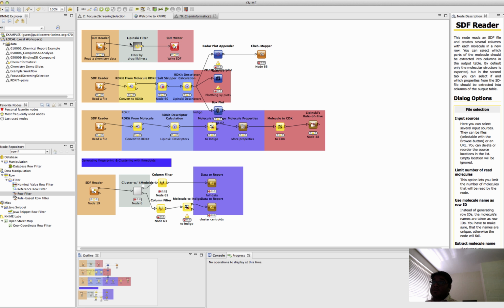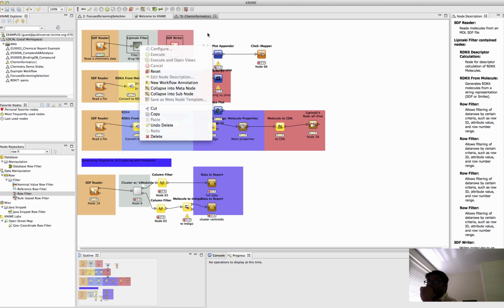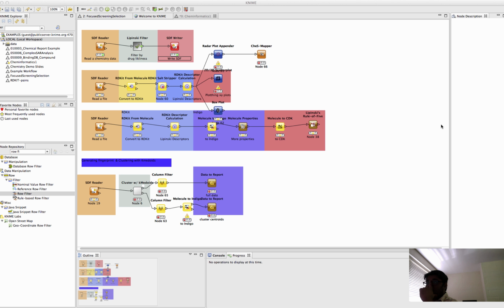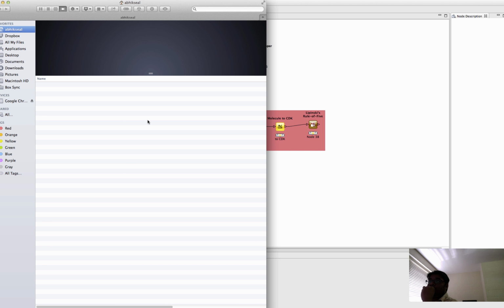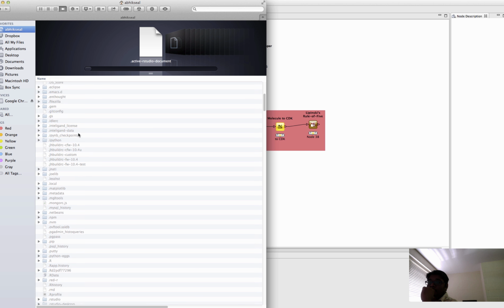So let's run it and see what it says. This was already running and it got queued here because it was processing, and then it's already written here. You can just see here. It got saved into a sample file. The SDF is saved already.